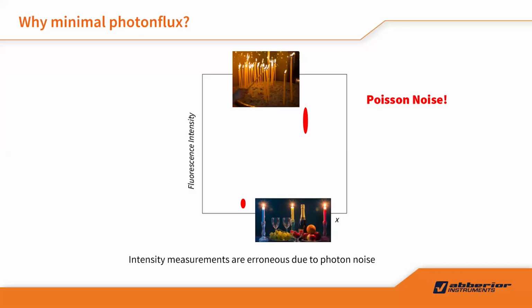If we go to a very nice restaurant, you light 2 candles or 3 candles. The total signal intensity is low. Therefore, it's very sensitive if you have one candle lighted up or extinguished. The Poisson noise range is smaller. It's more sensitive for the system to detect.